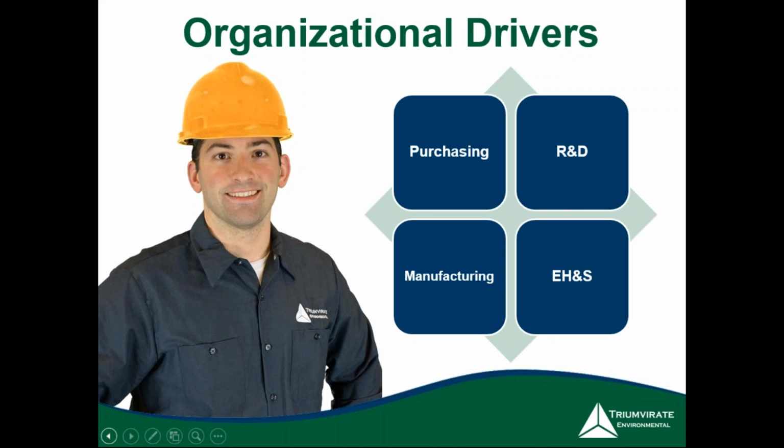So purchasing, basically just looking at procurement options, can help prevent over-purchasing by employees. Knowing what's in your chemical inventory can help employees manage what they're ordering and keep your inventory from growing out of control. It's just a good safety measure to have in place, because if people are ordering chemicals and don't know what's on site and just keep ordering, it can get out of hand pretty quickly. So having some sort of procurement or purchasing link with your chemical inventory can be pretty beneficial.